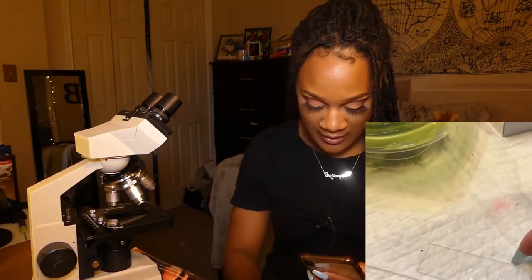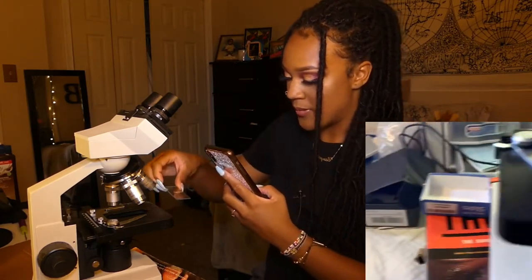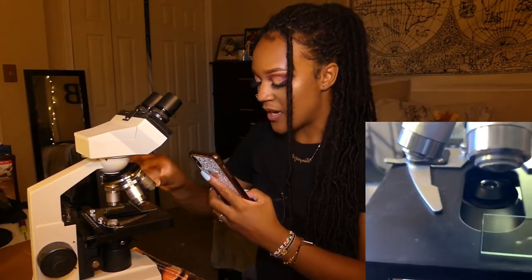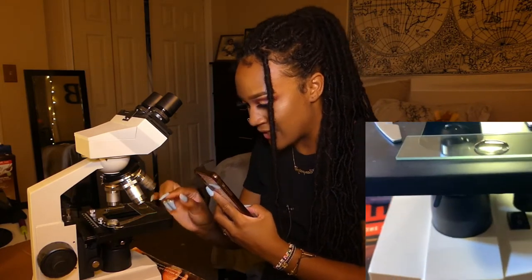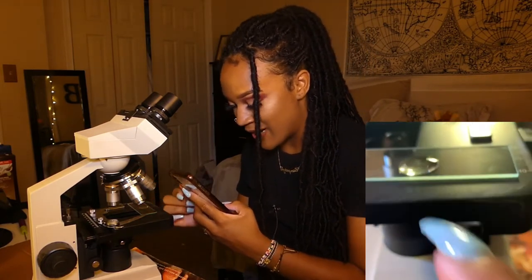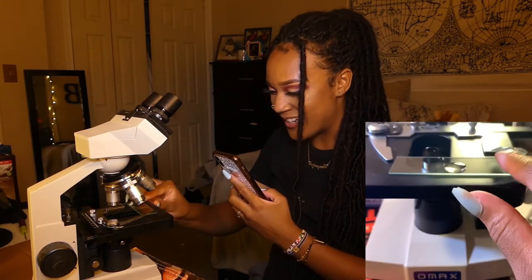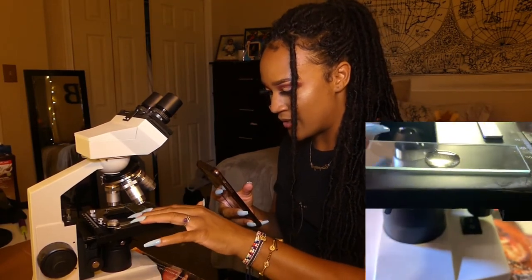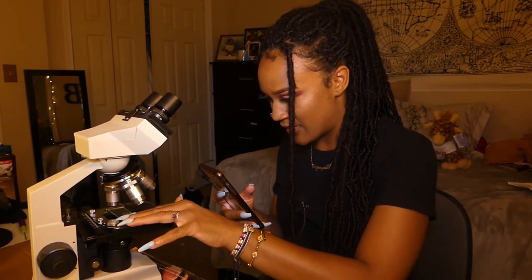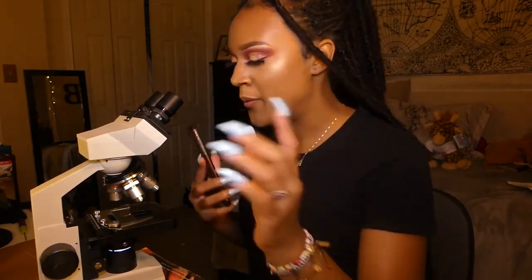And then carefully take my slide onto my microscope. I'm gonna try to see what I can see without a cover slip. And if it's too much movement... I can see movement already. Oh my gosh, can y'all see that? Oh my goodness, I'm so excited. Oh my gosh. Okay, I'm gonna take my slide and push it onto the stage and clip it with the stage clip. I'm going to attach my phone.